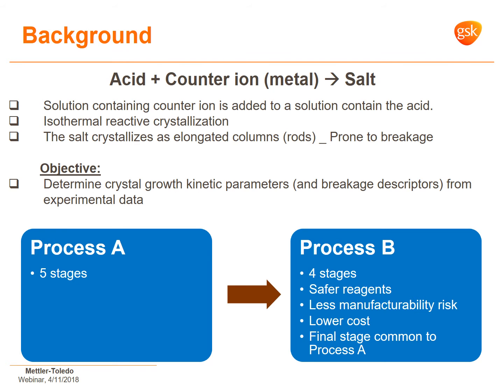So quickly, a background. We deal with salt formation, which you see very often in the pharmaceutical industry, where we have a parent and we add a counterion to it to make a salt. There are several drivers, several motivations to make a salt. It can be solubility enhancement or chemical stabilization and so on. In this situation, we have a parent which is a free acid. We add a counterion in solution at constant temperature, and the salt will crystallize as elongated rods, which are prone to breakage, and I'll get back to that later.